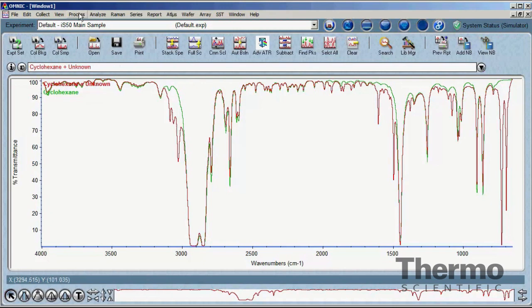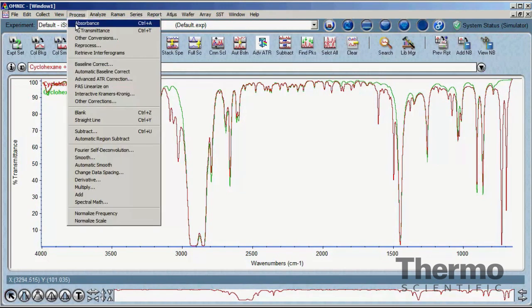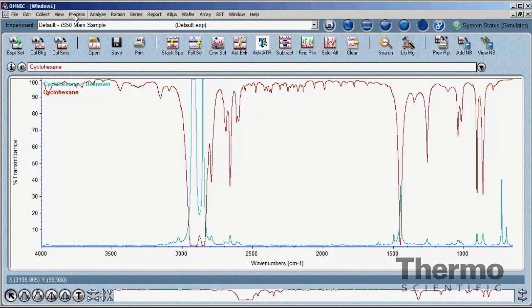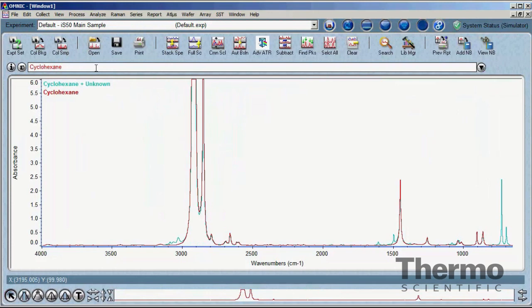Before the interactive subtraction can start, the spectra need to be in a linear y-axis scale. Absorbents, log 1 over R, Kubelka-Munk are some examples.